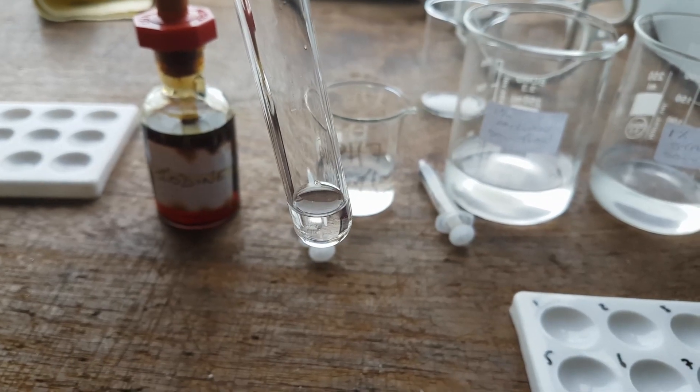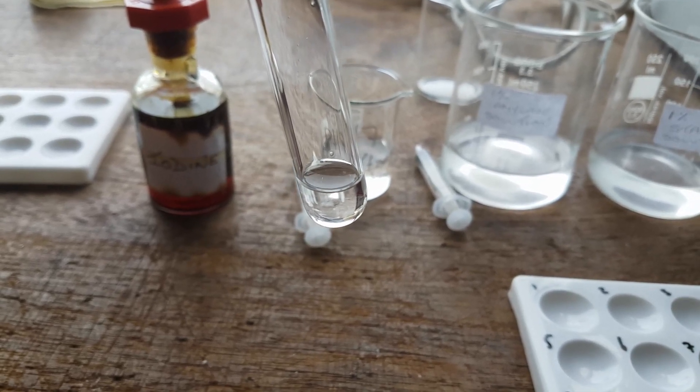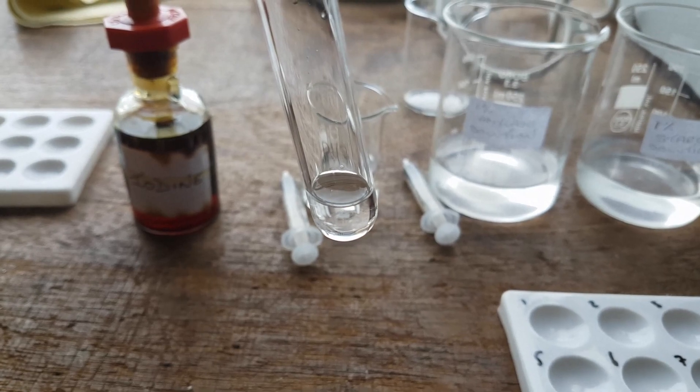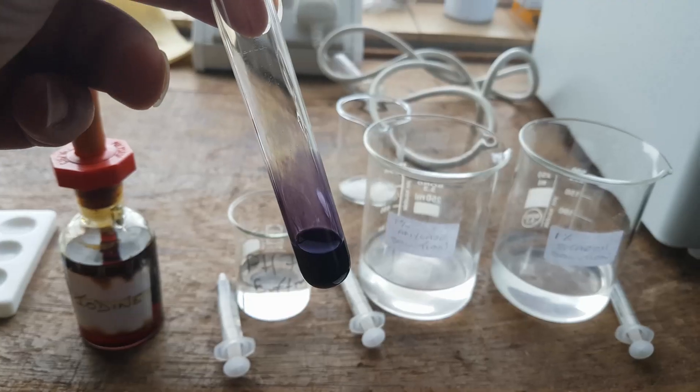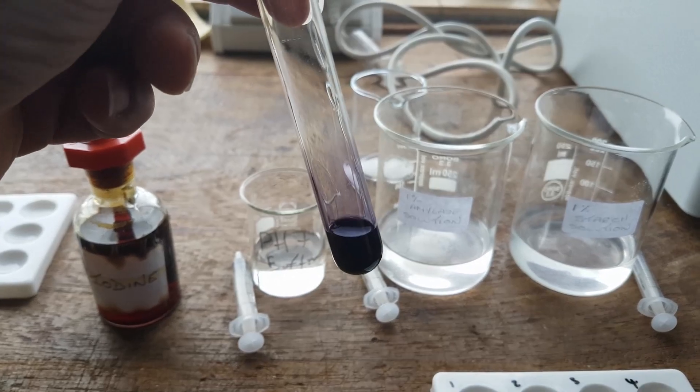This is another test tube but this time it has starch present because it's a starch solution. And I'm going to add the iodine into it and that should give us our positive result. As you can see, the starch has turned into a blue-black color. This is a positive test for starch.